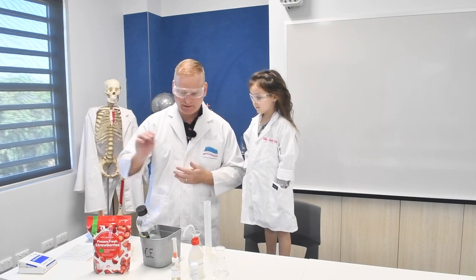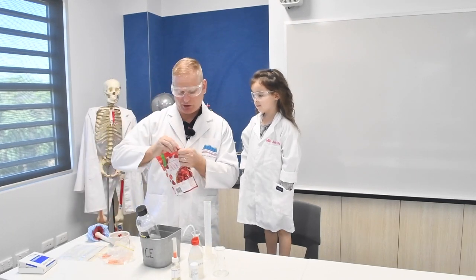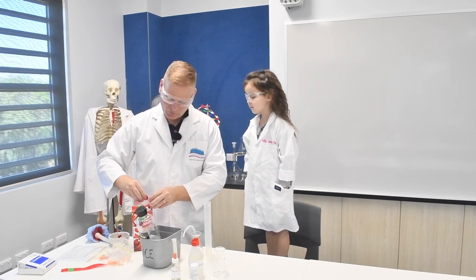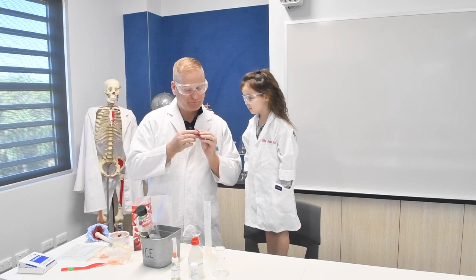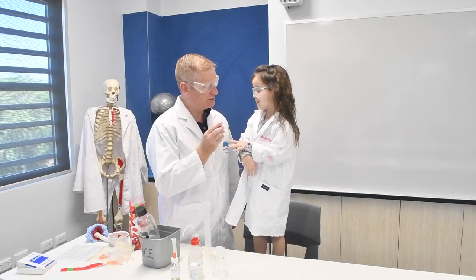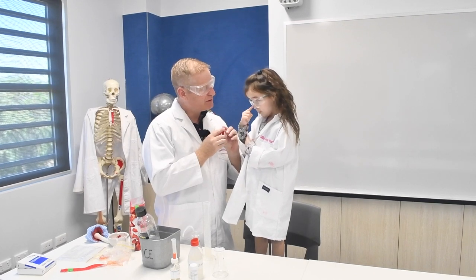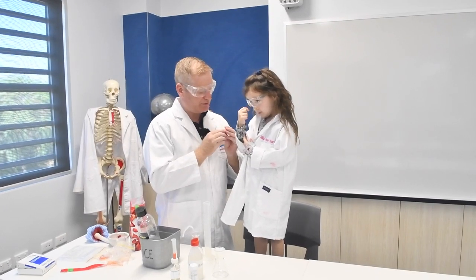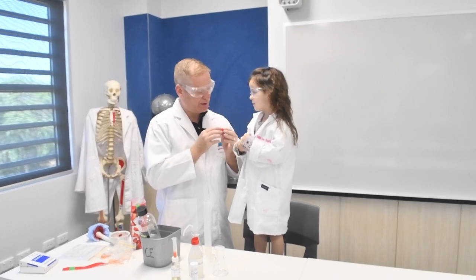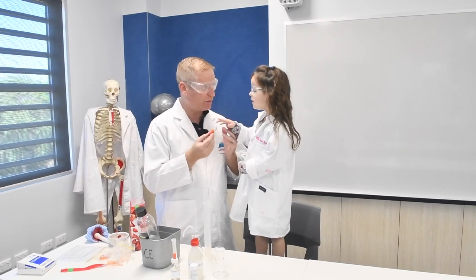Now, the strawberries are made up of teeny tiny little cells. So if we actually open this bag of strawberries and we have a look at one of the strawberries, it's a bit icy. So this strawberry is made up of what? Oxygen. Not oxygen. It's made up of teeny tiny little cells. And the cells are the building block of the strawberries. Cells. Yes, cells. And inside every single cell is DNA. And the DNA tells the cell what to do.